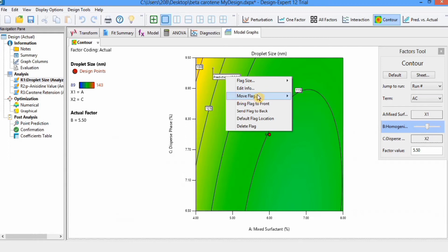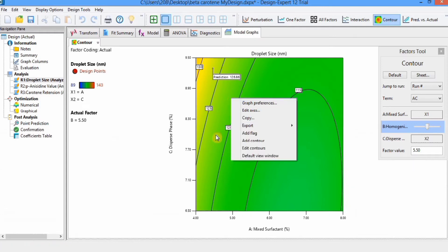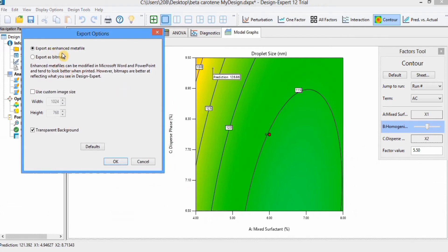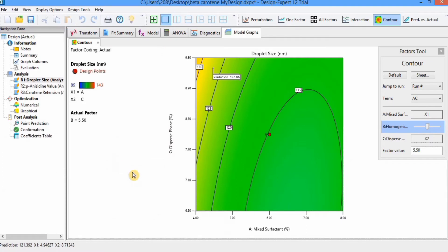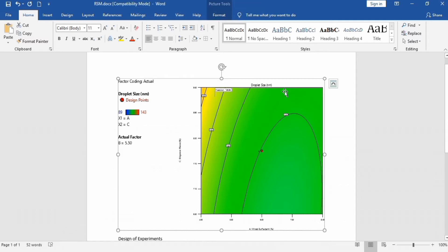You can also move these flags. If you want to export this graph to a Word file, right-click on the graph and find the Export option. You can export this file to Word, PowerPoint, or to a file. I will click Export Graph to Word, select Export as Enhanced Meta File, and click OK. You can see that this graph is transferred to the Word file.